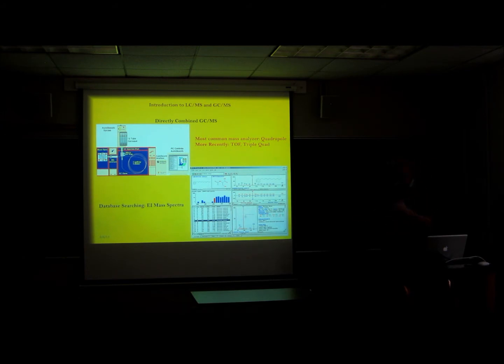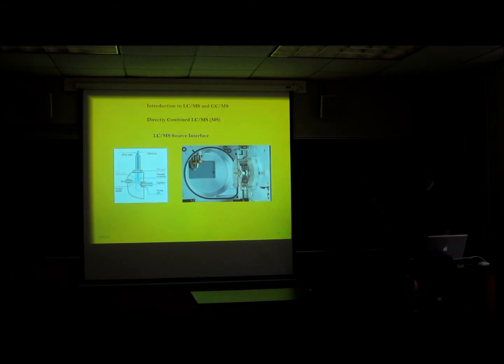With LCMS, using electrospray, whether it's a quadrupole or time-of-flight, the mass spectra you get are very dependent on the source design of the manufacturer. They're very dependent on the analyzer design of the manufacturer, such that the mass spectra you get are not well standardized. So doing database searching on LCMS spectra similar to doing it on GCMS spectra really isn't possible. Can you do database searches based on accurate mass? Yes, but it's much more involved, and depending on your mass accuracy, you'll have varying levels of success.